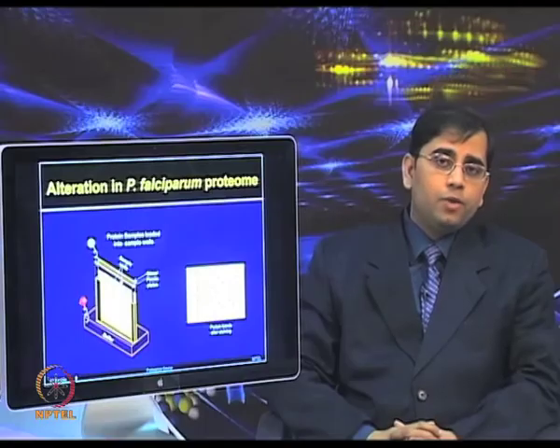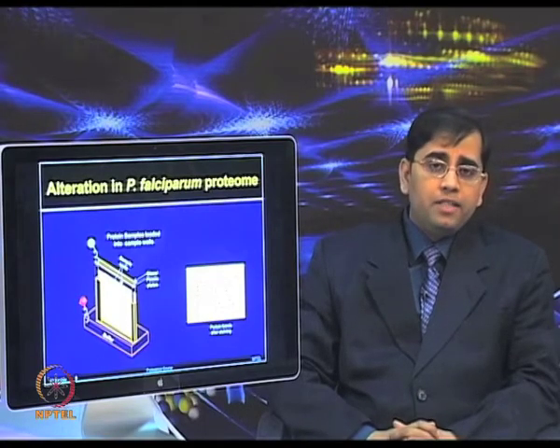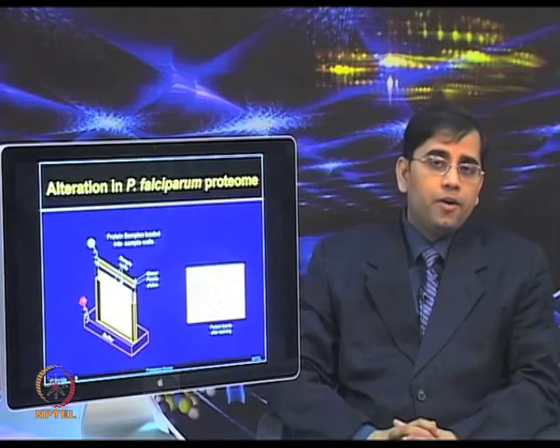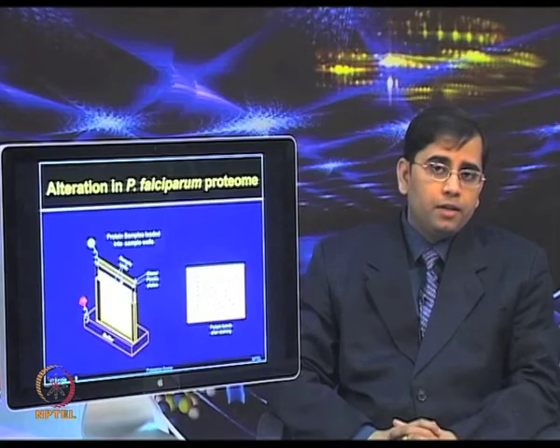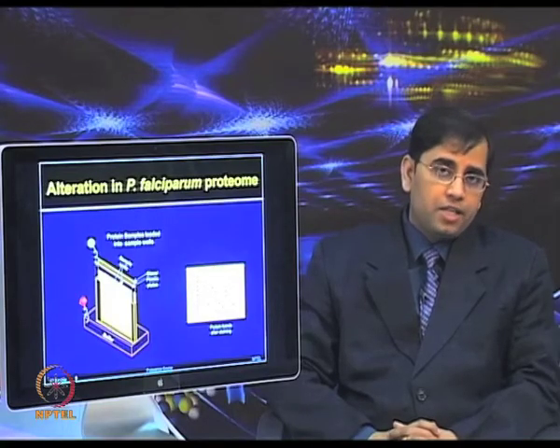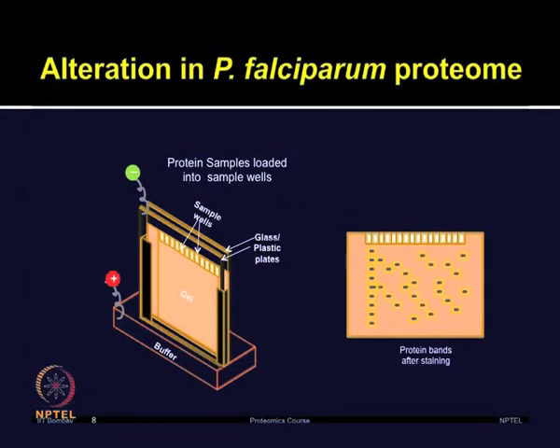Once protein extraction was done, the authors used IPG strips of pH 3 to 10 range for the first dimension separation of proteins in the linear IPG strips. After the IEF was done, they equilibrated these IPG strips and applied them on a 12.5% vertical SDS gel.